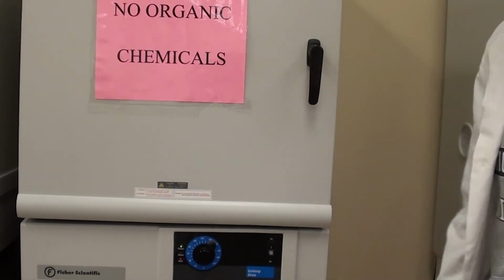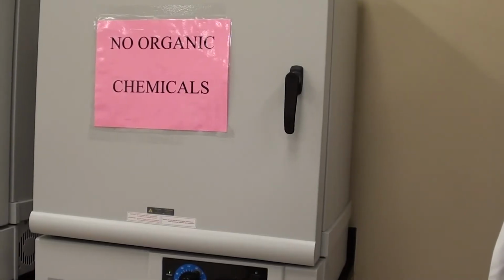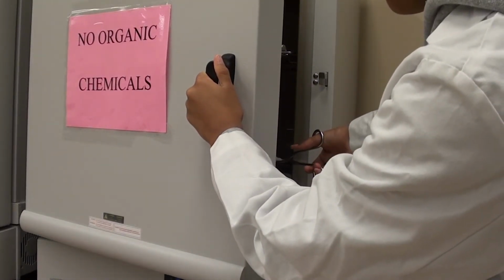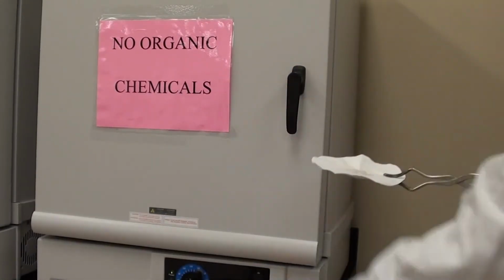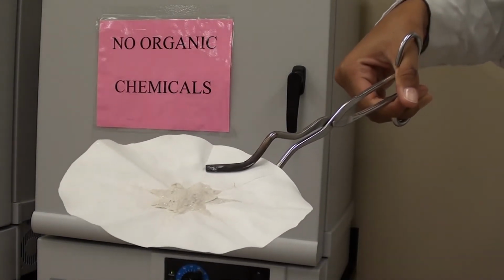You'll notice she didn't spend a whole lot of time with the oven open, that way we keep the heat in. Also, the sample's done, so let's go ahead and take it out. Now, generally, it's going to depend on the oven, but let's take a look at the sample here, Sabrine. Would you mind bringing it up to the camera, please? You'll notice she's using tongs here. Would you bring it a little bit higher? Thank you. And you can see that sand looks dry.